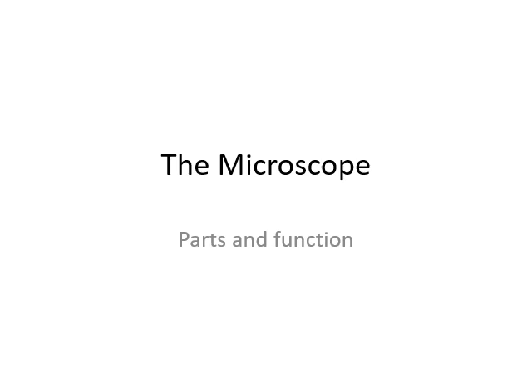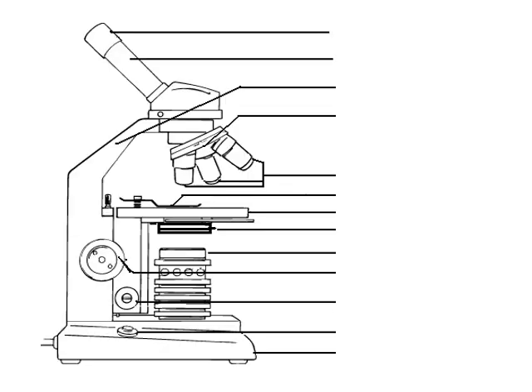You should have a printout of the microscope. If you can't print it off, no big deal. Just sketch a crappy one as we're doing the notes. And when you get back, I'll just make sure you get a copy of the microscope. Alrighty, so let's just start. So you should have a diagram that looks like this that you printed off. If you don't have one, just sketch one in your notebook and I'll make sure you get a copy when we're back at school. We're going to go through each of the parts and what the function is.